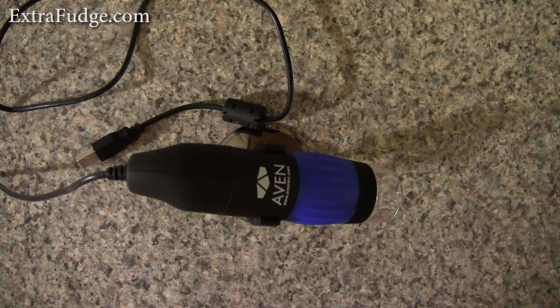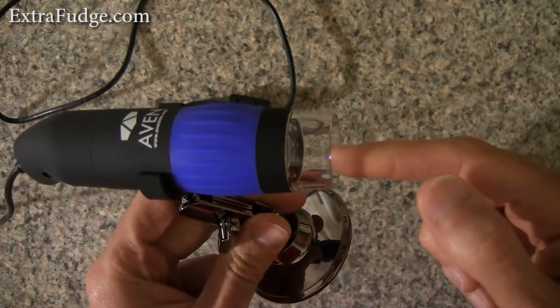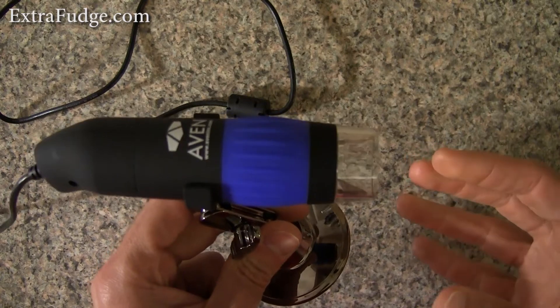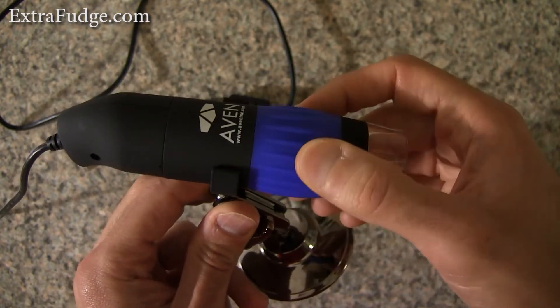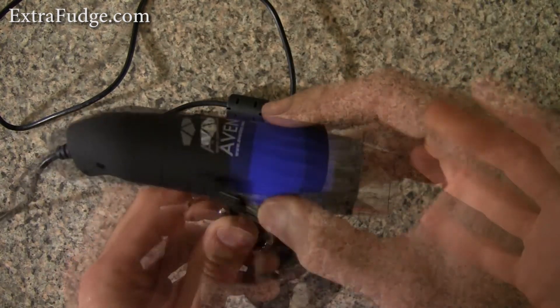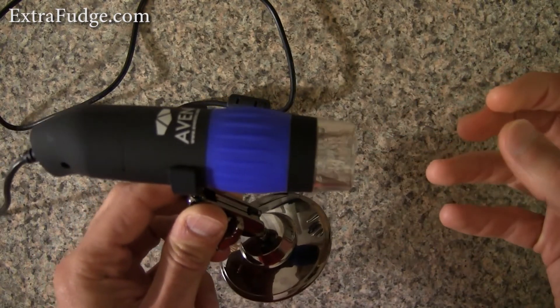Let me start by talking about what I don't like about this microscope. The 10 to 50x magnification is purely related to how close you put the object to the lens and focus. I actually thought I could rotate some sort of ring to change magnification — I didn't expect you had to physically move the object to change the magnification.